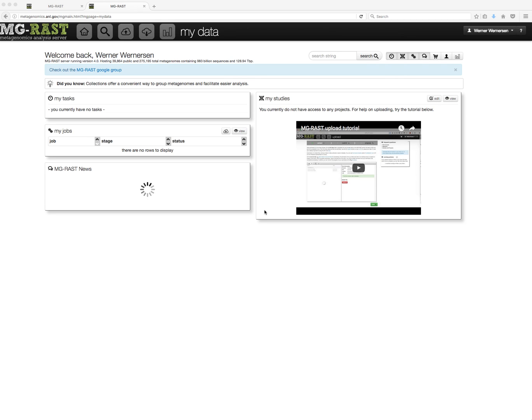There are two places where you can create a collection. One is the study page, which we will get to later. The other is the search page.